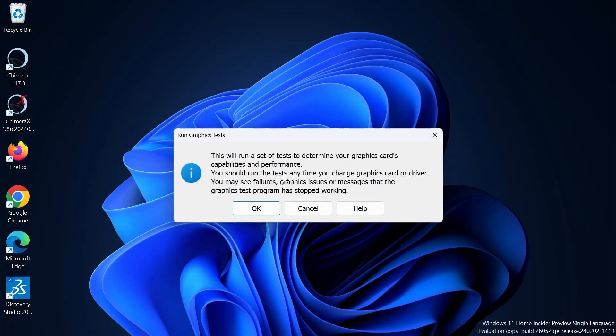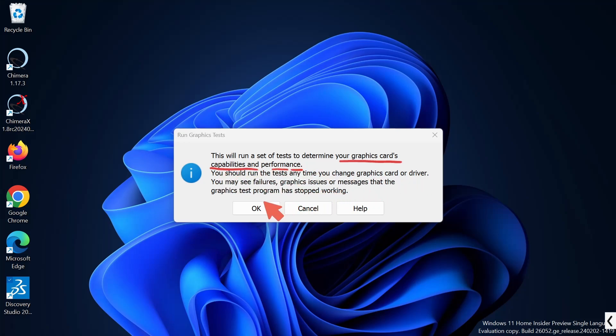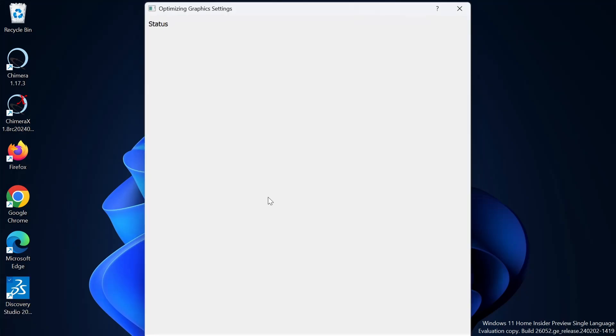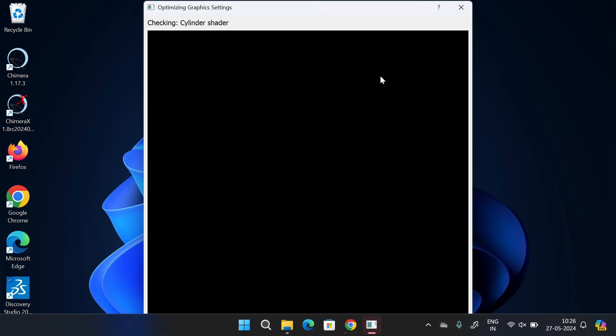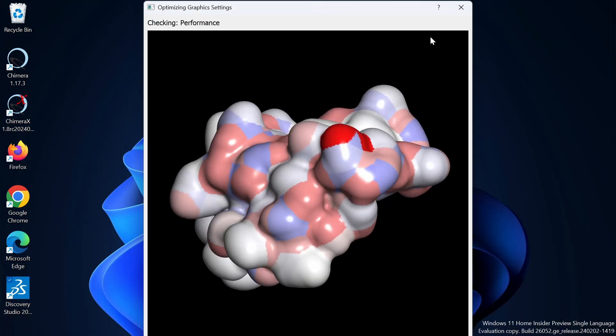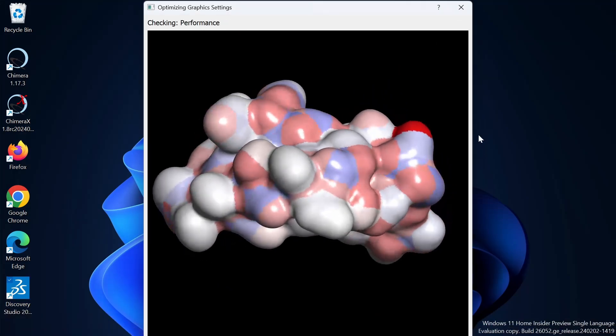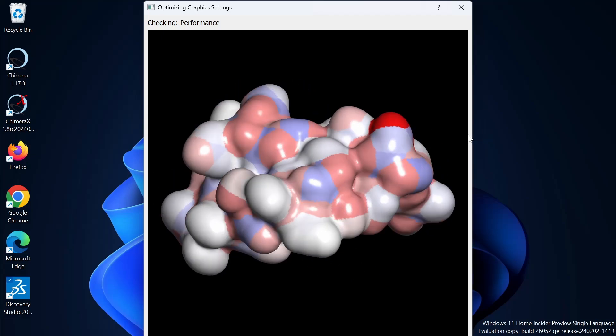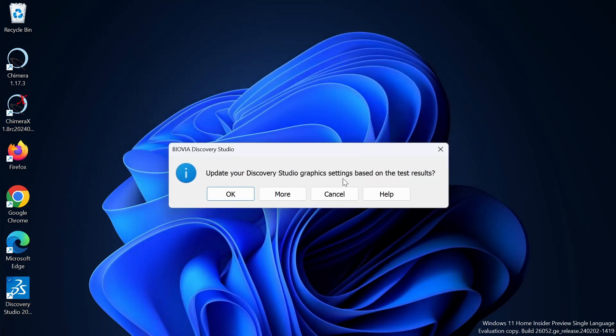This will run a set of tests to determine your graphics card capabilities and performance. So I'm going to click on OK. And it will go through some of the tests, like polygon anti-aliasing.